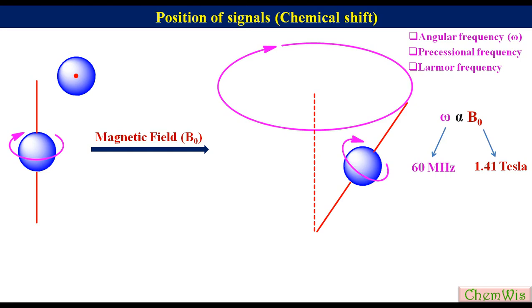When the frequency of oscillating electric field component of applied radio frequency waves matches the frequency of the electric field generated by the precession of the nucleus, energy is transferred from the radio waves to the nucleus that cause transition of nucleus from lower state to higher state, giving rise to absorption peak.